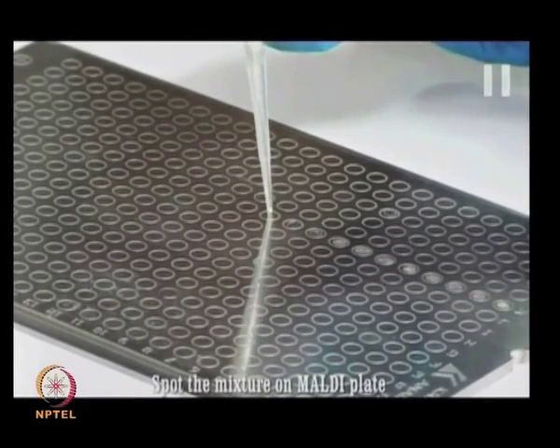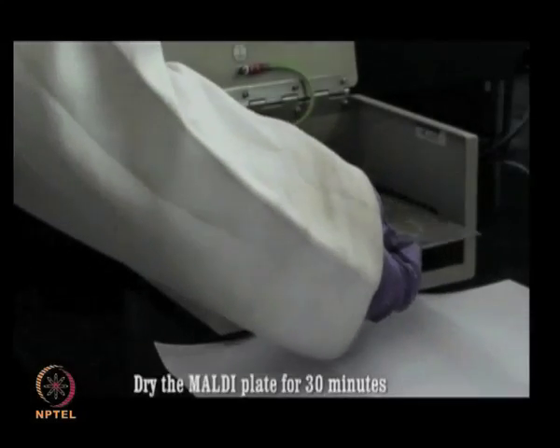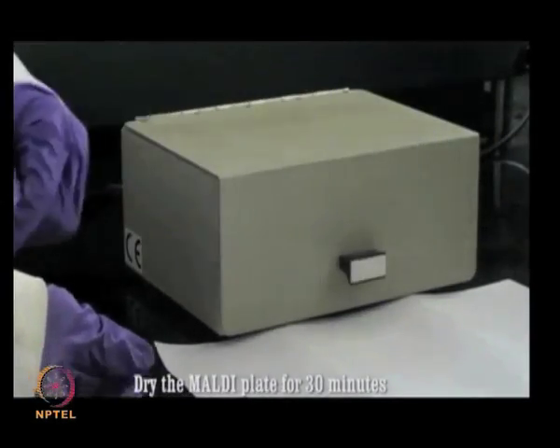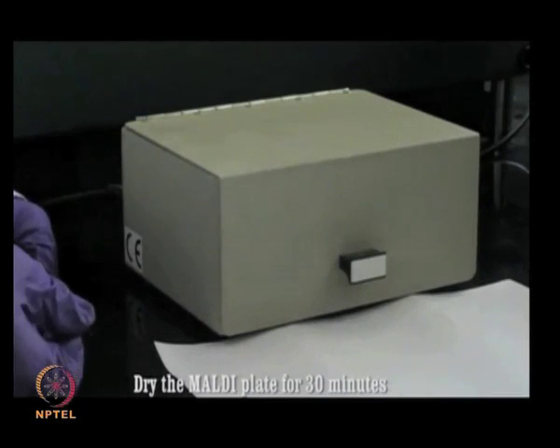So, spot the mixture on the MALDI plate. How uniformly you can plate these mixtures on the MALDI plate ensures good spectra and data quality later on. Once completed on the MALDI plates, the samples are allowed to dry for 30 minutes, after which the instrument is switched on and MS analysis can be performed.